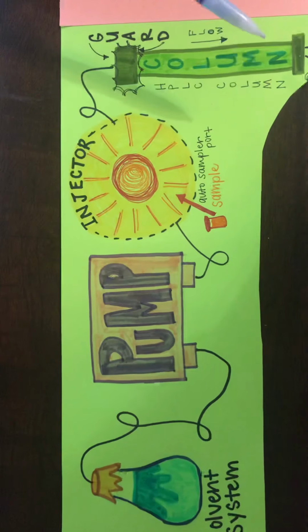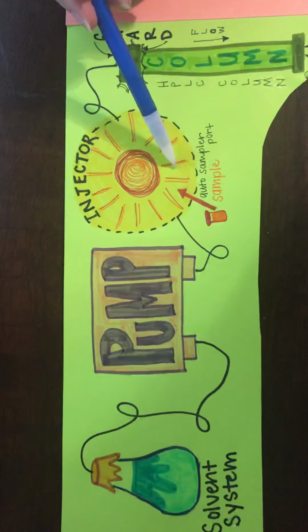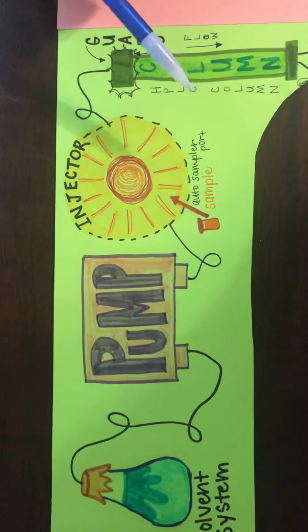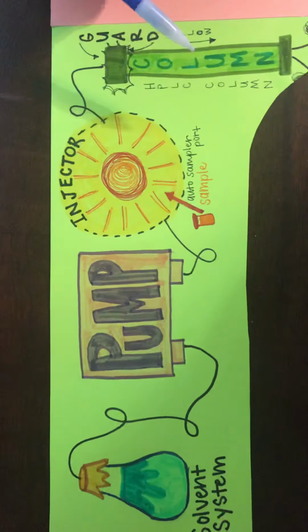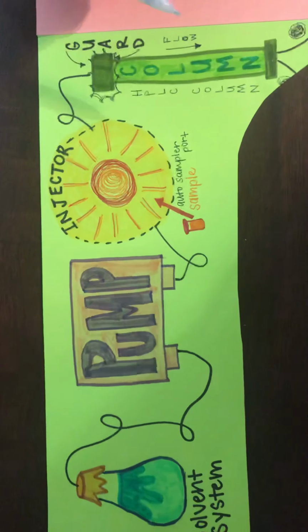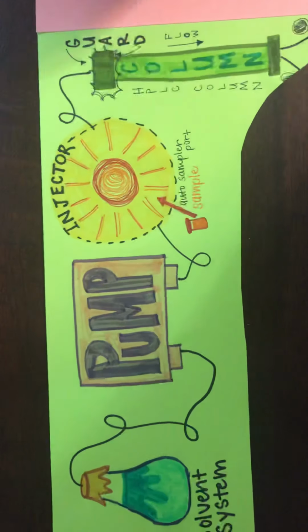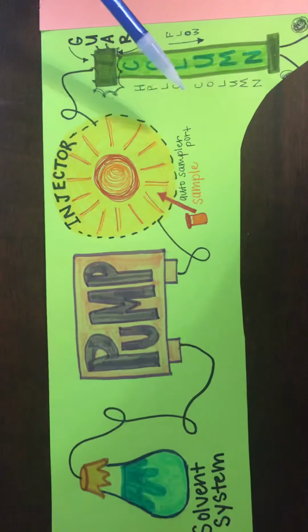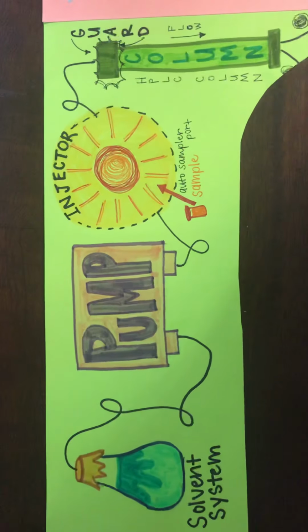And at our injector site, we have vial inserts that we can use on a sample that's on a microliter scale. Oh, okay, done with the tongue twisters. We use the vial inserts so that we don't have to dilute our samples to a larger volume.